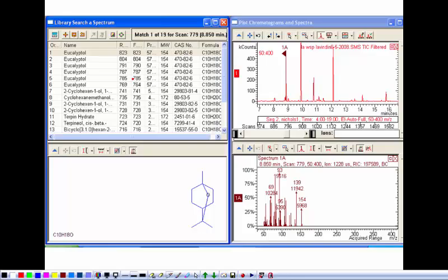And so that's pretty much par for the course. If I wanted to know where it's found, I could find out, because there's another button I can push, and it'll give me all the references. It'll tell me what places it's been found, what papers have been published on it. I might find a paper that says, determination of essential oils in some weird plant. Well, I would know that eucalyptol was part of that. And so I can take a molecule or a mixture apart relatively quickly.